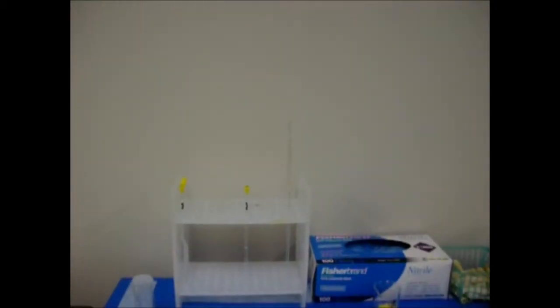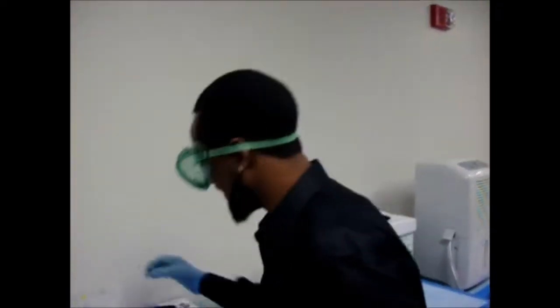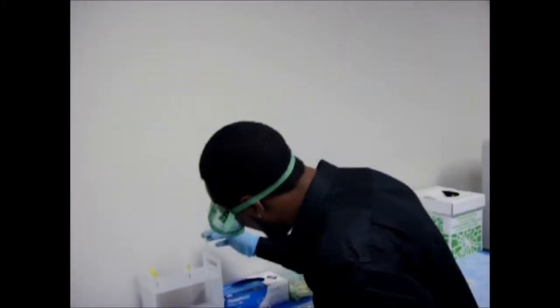You need a helping hand on that, partner? Well, I would ask for your help, but the last time I did, it didn't end up quite so well. So you can stay on the sidelines right there. No problem. Alright, so does the liquid actually get to the level of water boy? It doesn't get to the level of water boy. It actually gets to the level of football player. Oh, does it? Yes. Wow.